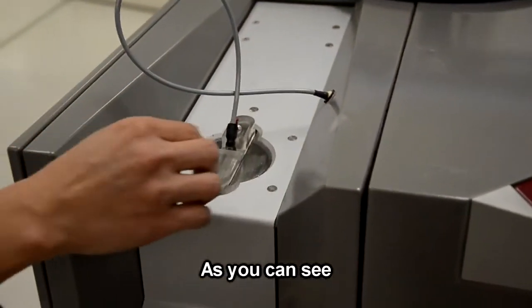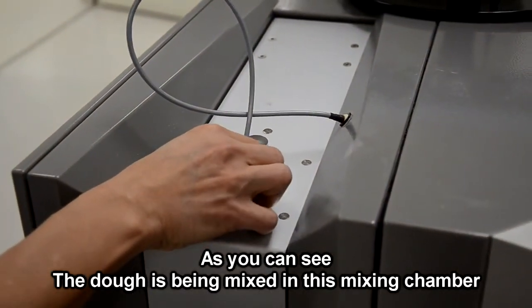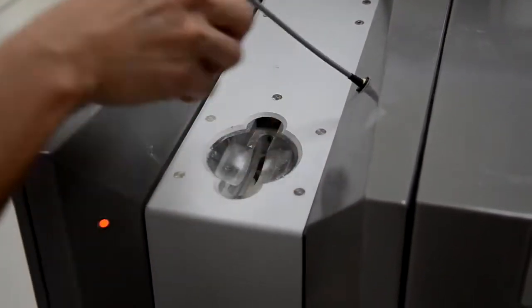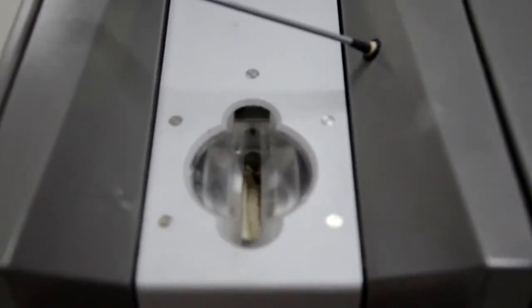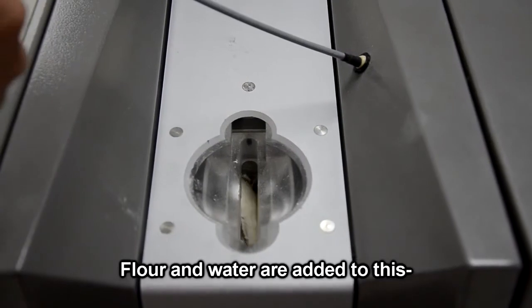You can see the dough is being mixed in this mixing chamber. Flour and water are added to this.